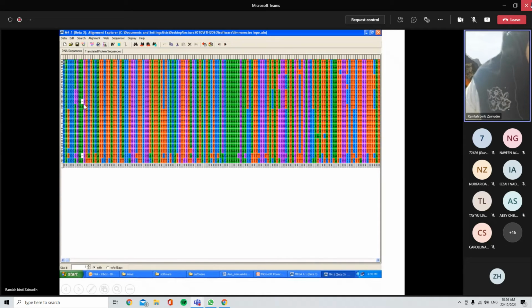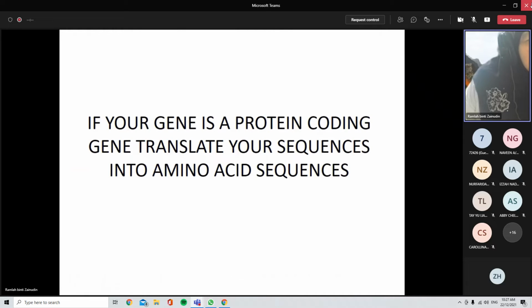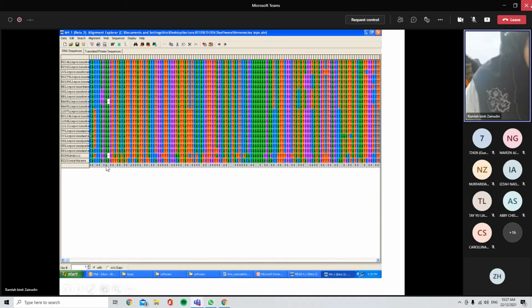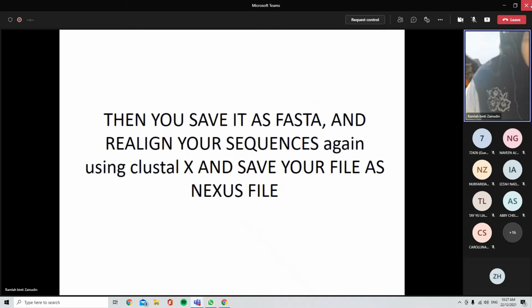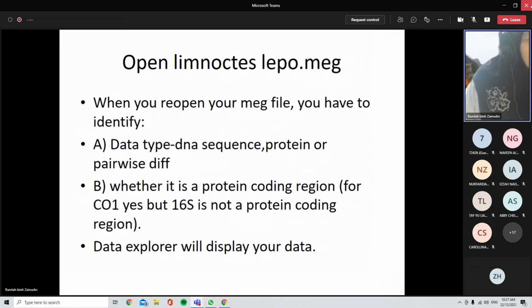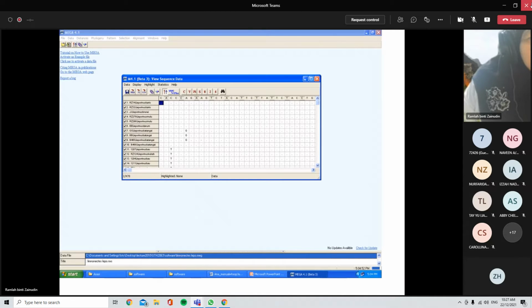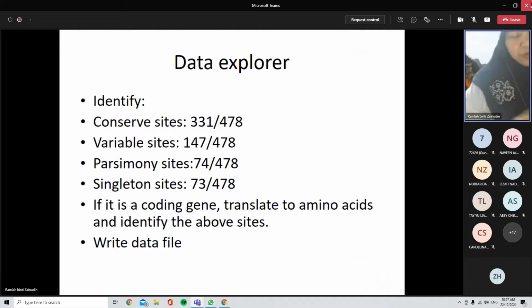So this is what is called the asterisk tadi yang dia akan cari. Of course this one is already removed lah, kita tak nampak lah. But sometimes dia ada, bukan yang ini, this is for the variable set. Ini apa ni? Oh, this alignment. Okay, sorry. See the conversion. Okay, dia tak tunjuk sini. But after you finish all those sequences, so this is the data explorer.